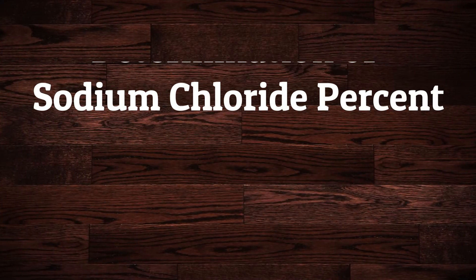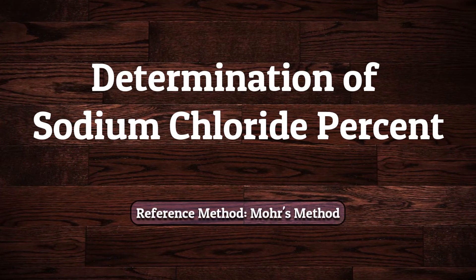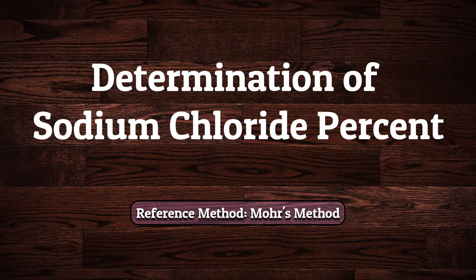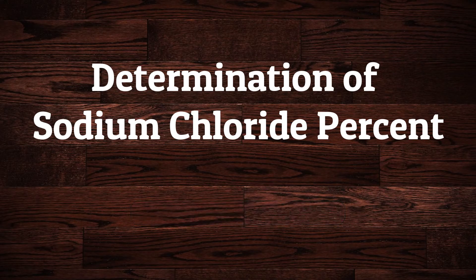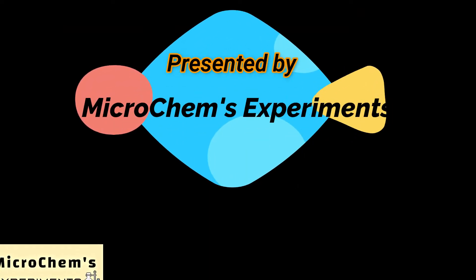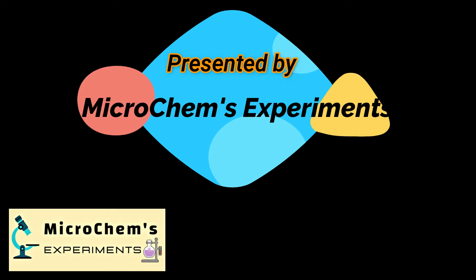Determination of sodium chloride percent is a very important testing parameter for salt and food samples. In this video we will determine the percentage of sodium chloride of a salt sample by Mohr's method. Welcome to the channel MicroChems Experiments. Be with us, be a laboratory expert.